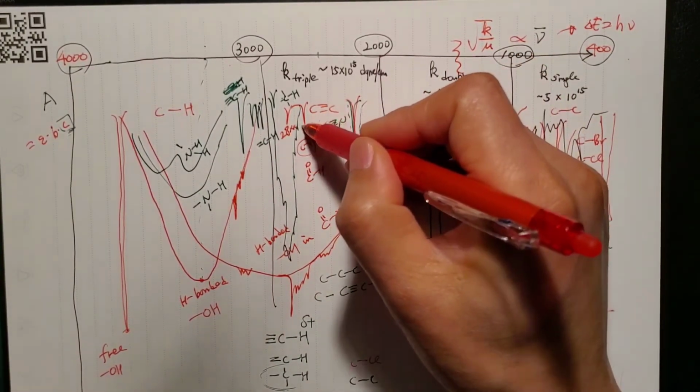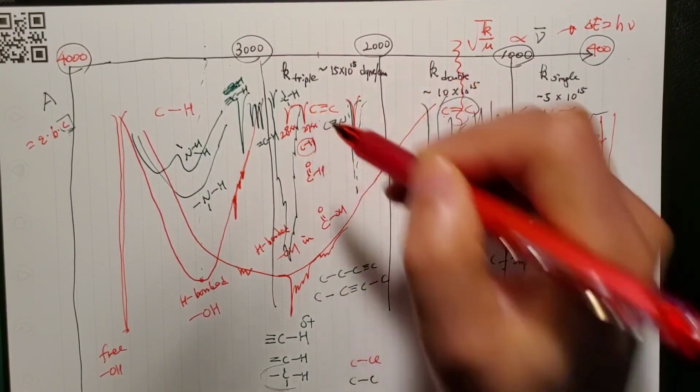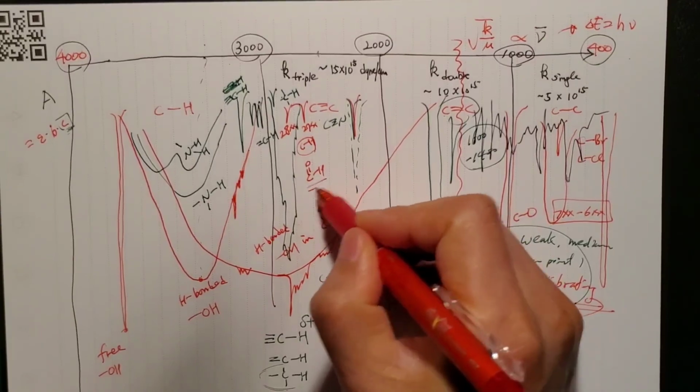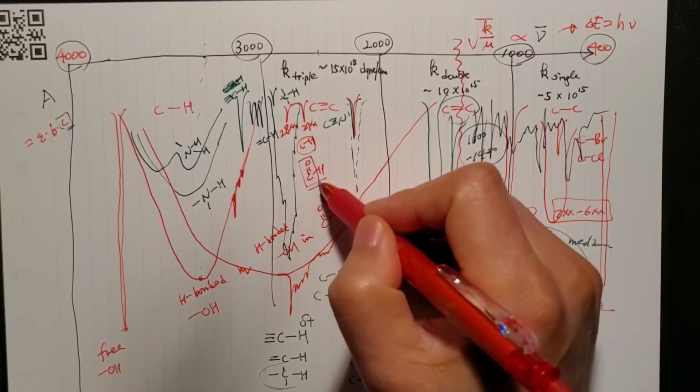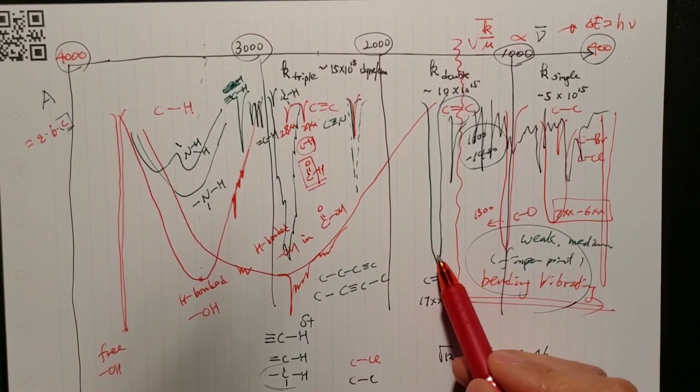But if you see something little outside or at the skirt of this peak, then you have to sort of guess and hypothesize, I might have an aldehyde. Okay, you don't want to ignore those little peaks. Then how do you confirm? Well, in the same light, you need to check whether you have a carbonyl group. So you go to the 1700 area.